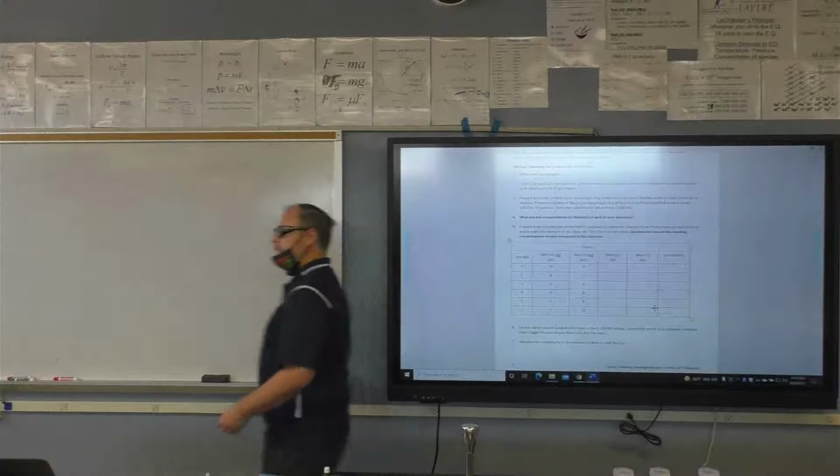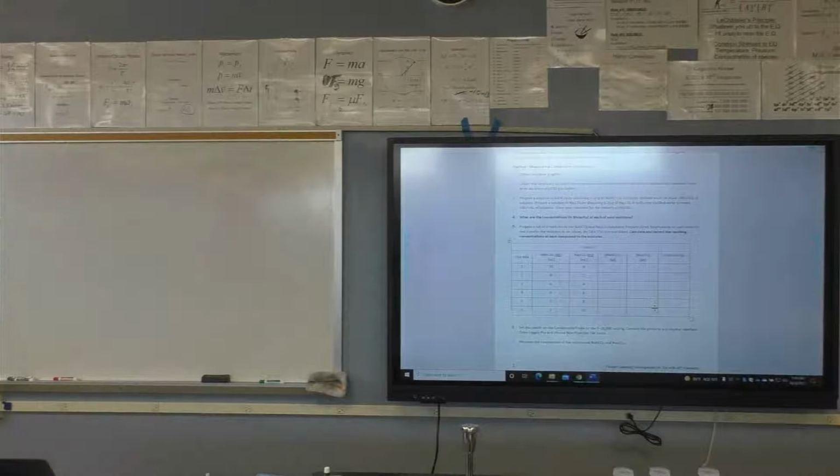Now, how do you use these? The best way to make these solutions, where we talked about whole milliliters, is with a pipette, with glass pipettes. We don't have glass pipettes, but we have these really cool little syringes, graduated at 5 milliliters. So if you need 4 milliliters, just stick it in there, get all the air out. Whoop, 4 milliliters. Cool. And if you need some more, I can grab a bunch of these for you too. There's a bunch back here too. Just make sure you rinse them out really well first.